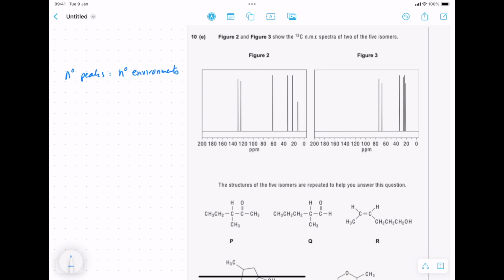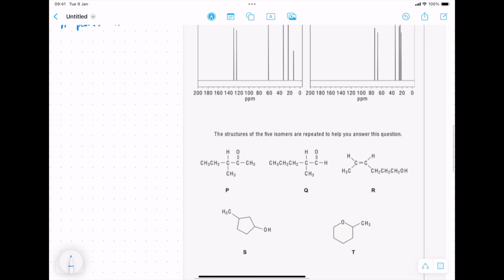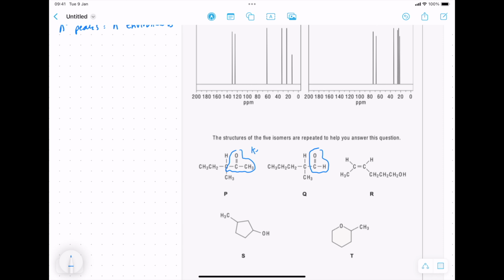So what I mean by that is, if I just take a quick look through this molecule, immediately I can see some key functional groups. For example, the aldehyde group, the ketone group, we have alcohols, and we have this one, which is kind of forgotten about at A level and advanced placement chemistry, and that's called the ether functional group. The ether functional group is an oxygen which is sandwiched between 2 carbons either side. And of course, your alkene double bond.